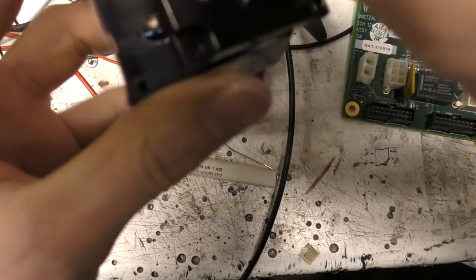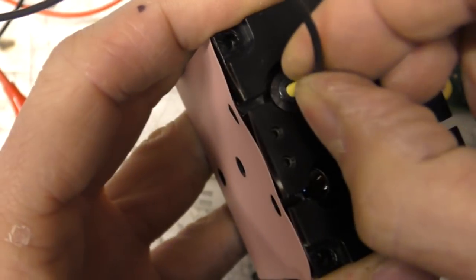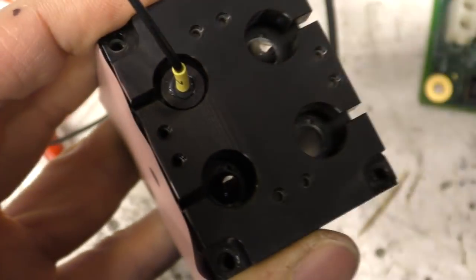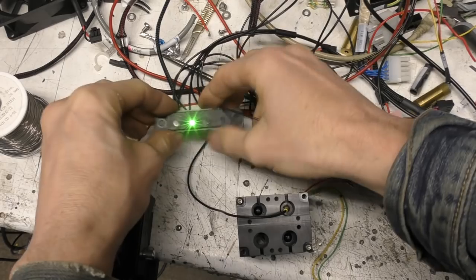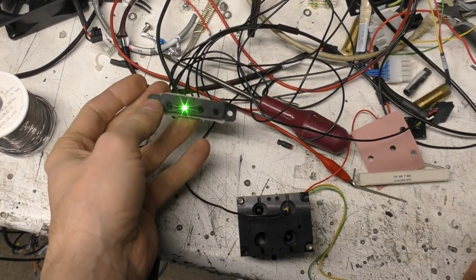And it looks like the way they align these is the fibre comes into this block, and then there's a couple of clamping grub screws. So this thing all gets clamped together, and by slackening off these grub screws you can move this around to optimise the light and then clamp it back down again to nail down the position. And when this is all aligned you get quite a bright light going into this section.